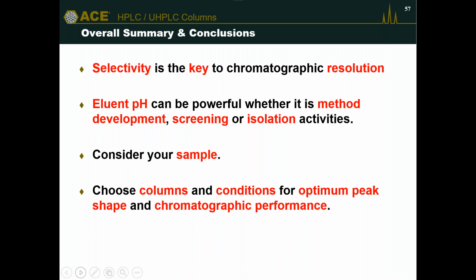And what I probably should have mentioned is that the pH guide that we have electronically has good ideas about how to mix which types of buffer to cover the whole pH range.